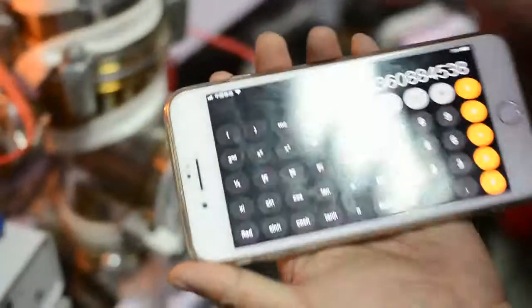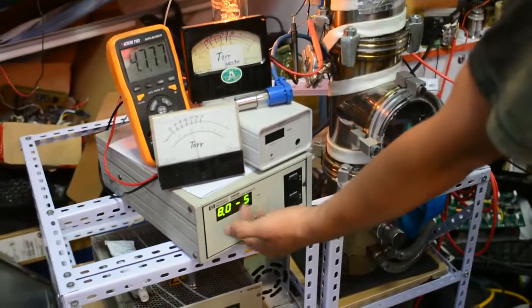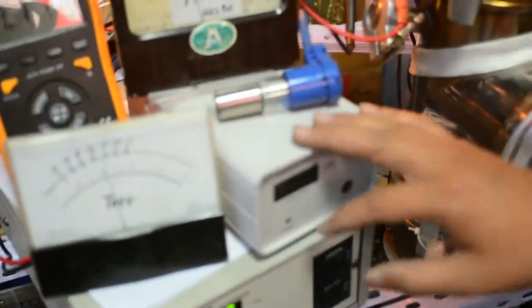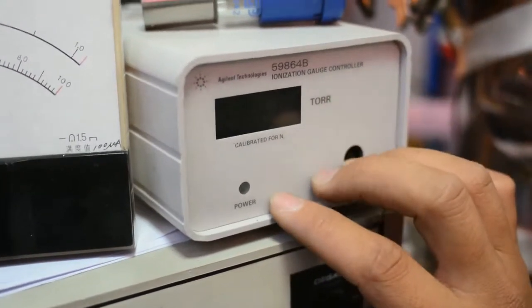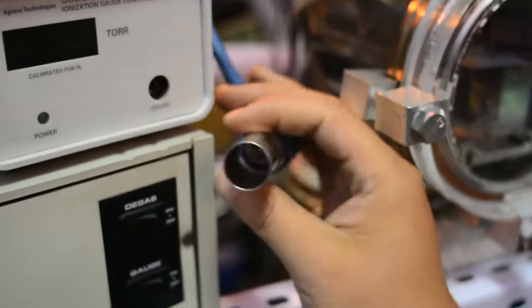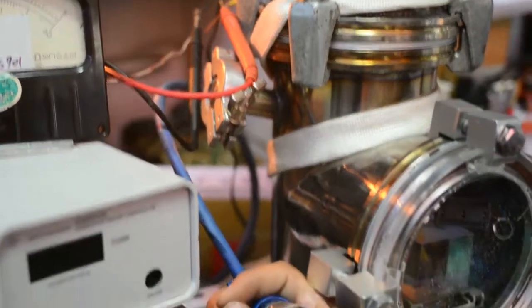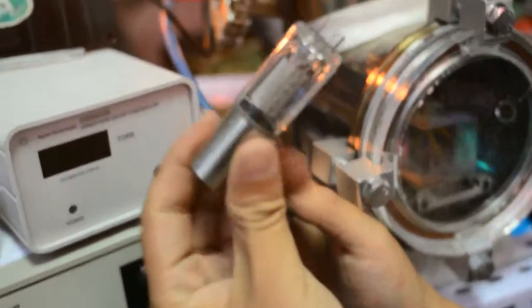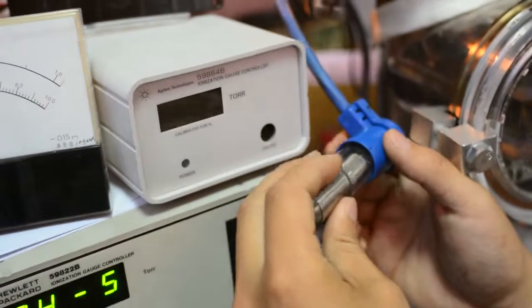So this is essentially the vacuum level accurate calculation — it's very complicated and not easy to use. This other gauge is also a vacuum ion gauge, made by Granville-Phillips technologies. However, it's awkward to use because I can't find an adapter to fit the vacuum flange, so I'm not going to use it. But it's very cute — look at that ion gauge tube. It also works well, but I don't want to use it.